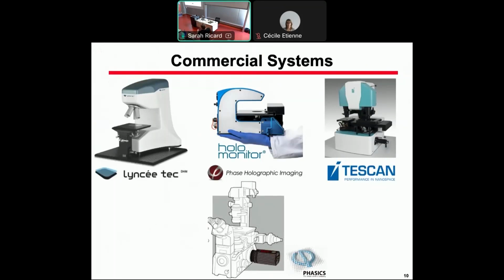Tescan is a more recent development, but it's also different. And you have the so-called wavefront analyzers, Phasics, which is a French company very active in the domain. That one has the advantage that it's like a normal camera, which you put on the microscope.